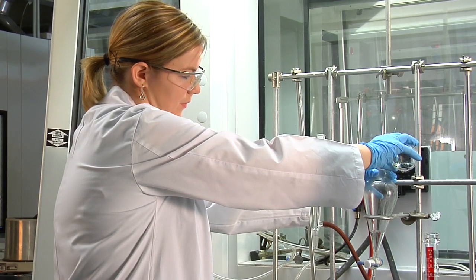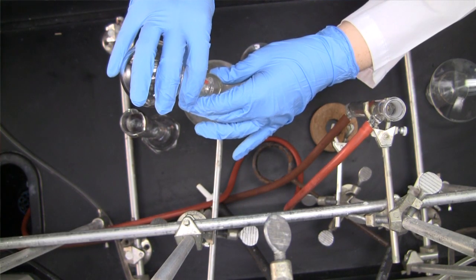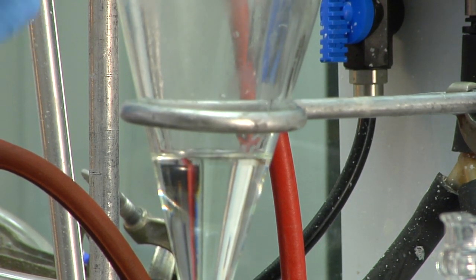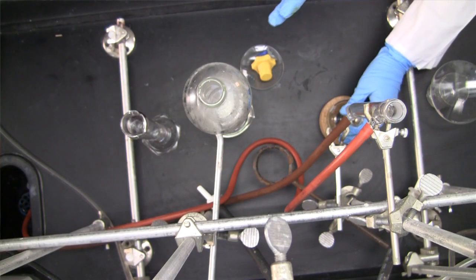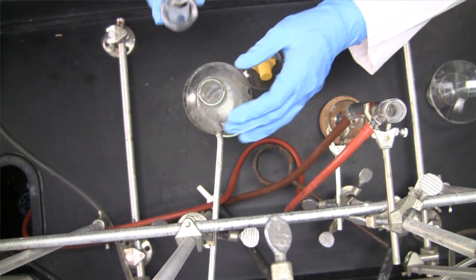And you can see some smoke because we have our solution a little too hot, so you want to make sure it's fully cooled, because we want to avoid this evaporation that you can see happening, because you can lose some product that way. Then what we're going to do is add 50 mils of water.